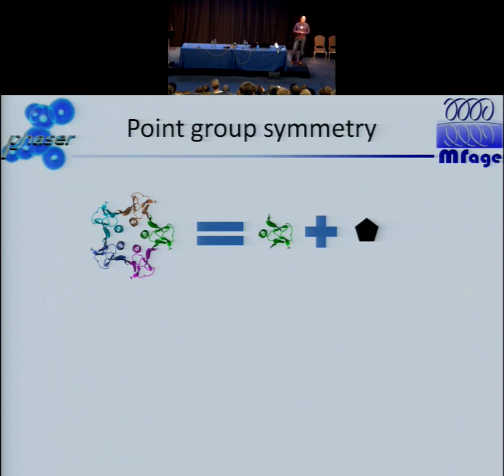As we are going along in a solution, the program can analyze the structure that we have, assuming that the structure is correct. So now, one thing that it can very quickly identify is if a number of monomers assemble according to some point group symmetry. Right here, it's actually quite easy to see by eye, but imagine that this is distributed over different asymmetric units or even unit cells. It would be quite difficult for you to see that this is 5-fold symmetry. But the computer would very quickly generate all the possibilities and then come up with a picture like this.